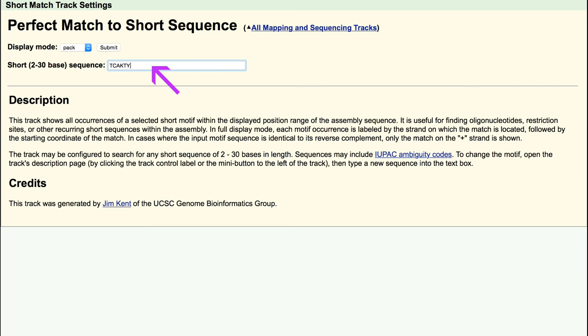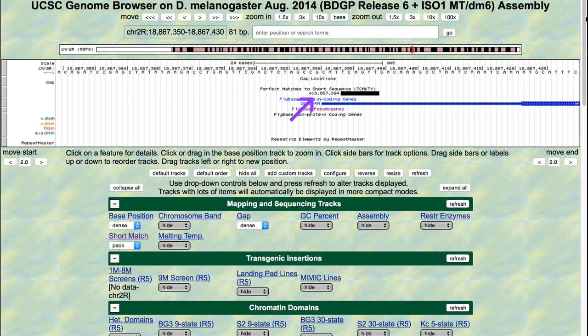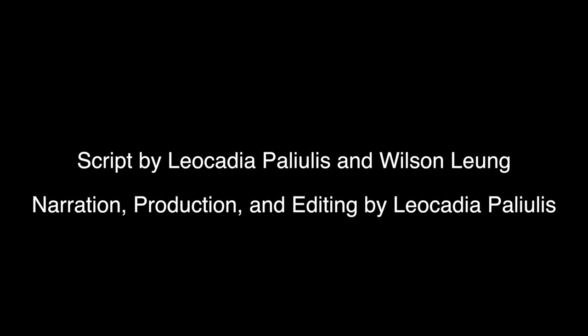After changing the display mode and typing in the consensus sequence, click Submit. You will see perfect matches to the short sequence appear as black bars within the browser window. The label next to the black bar describes the orientation and the start position of the motif match. In this case, the INR motif is located three nucleotides downstream of the annotated transcription start site of DPTB at 18,867,394 in the positive orientation. Click Submit.